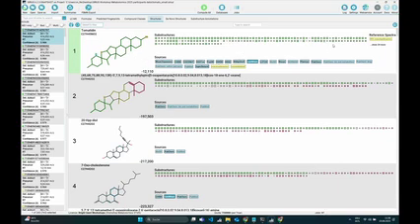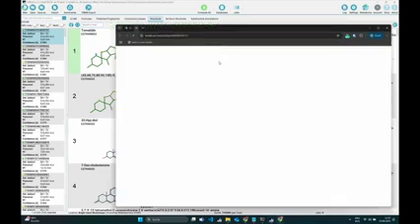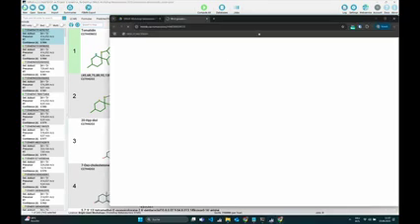So if we have a hit in a reference spectrum, which I will show very soon, we can also see this here. Here we have all the databases where this compound is contained. Because we did a database search, we now get, for example, HMDB, KEGG, and all the structure databases that this compound can be found in. And actually, because it's often a good thing to also verify a little bit more, we can click on such a box. So for example, we can click on HMDB, and I hope this works now.